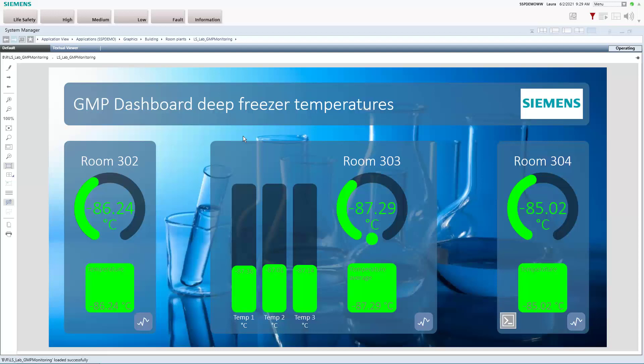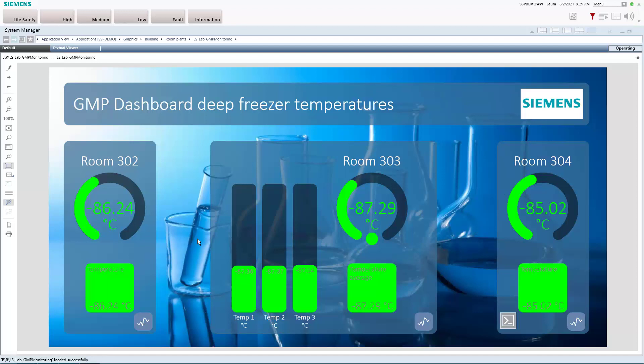Okay, so here we are and we are mainly responsible for the condition of three deep freezers. And this GMP dashboard here already gives us a nice overview on their conditions. So we see that everything is green which is always a good sign and we can also read the temperatures here and we see that they're all within a good and acceptable range.